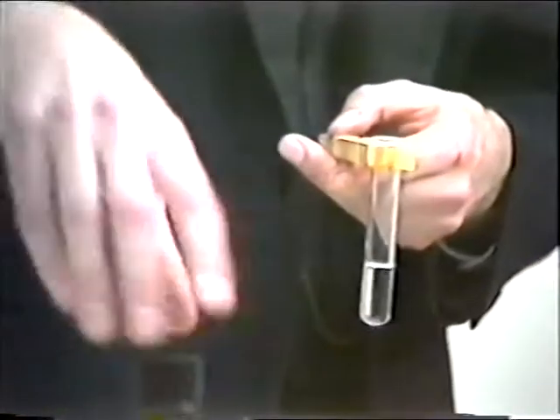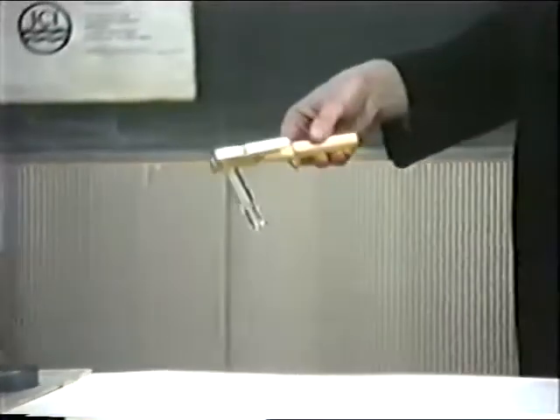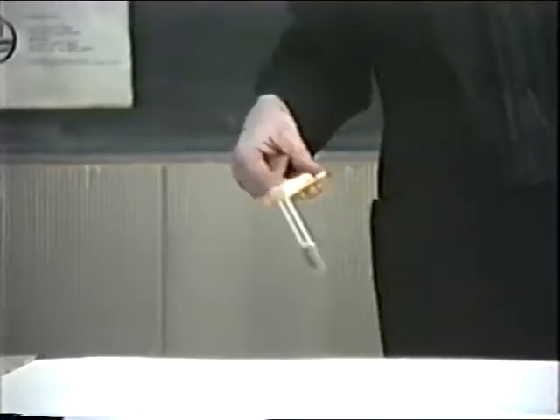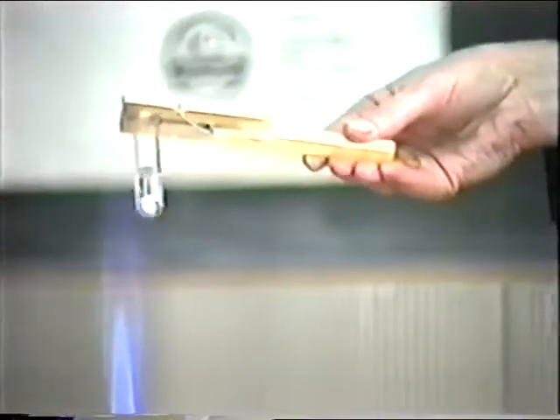A small quantity of turpentine shall be heated to boiling point in a Bunsen burner flame, and then I shall pour it onto a wad of glass wool which will be placed into the top of this cylinder, and we shall observe what shall happen.